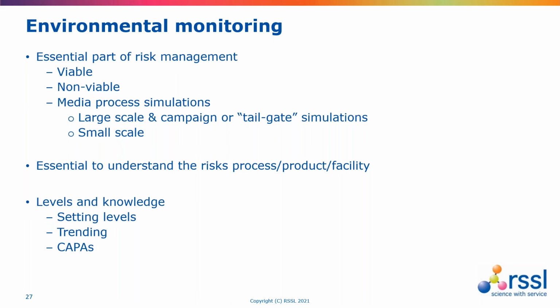So we need to have built into this what our viable monitoring strategy is, what our non-viable or inert monitoring strategy is for particles, and also how we're going to develop media fills in relation to aseptic operations. So the scale of the media fill, the length of the media fill, when media fills take place, whether they're independent activities or they're bolted onto the end of filling activities.